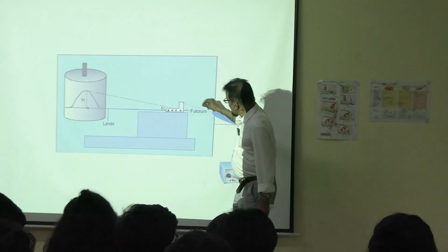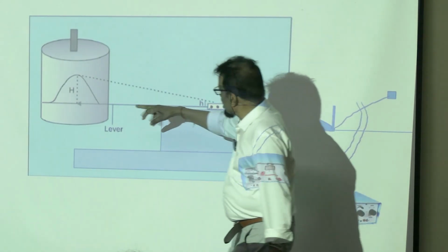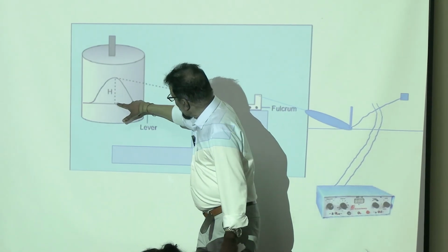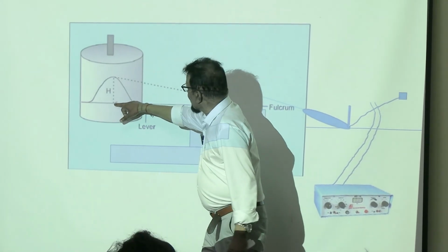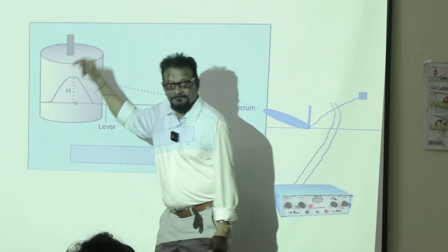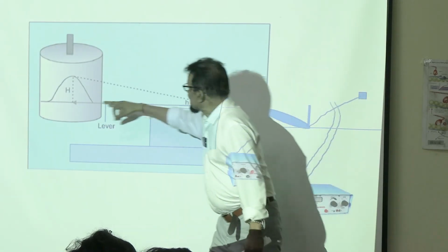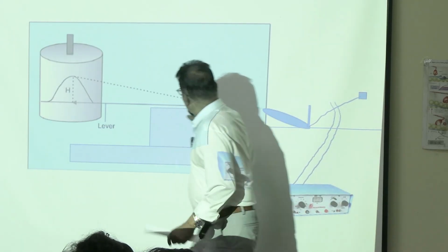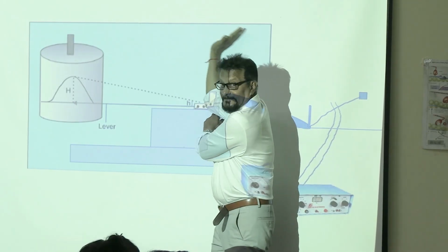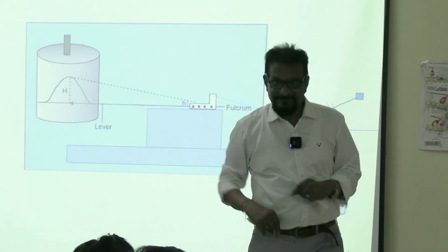Hello, look at this. You go on pulling it, and this stylus will be going up. From here, it will not be touching this point. This will come this way. Because this is an arc, this is the center, the fulcrum. So this will move like this. As a result, you will create a curved line.